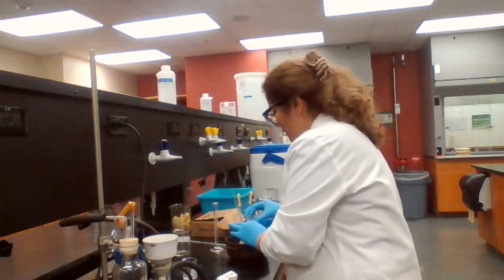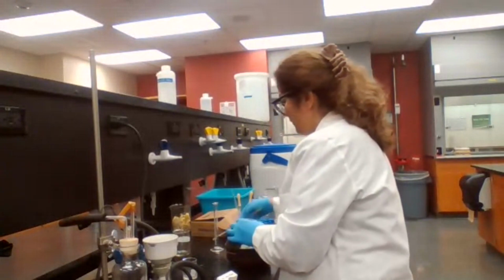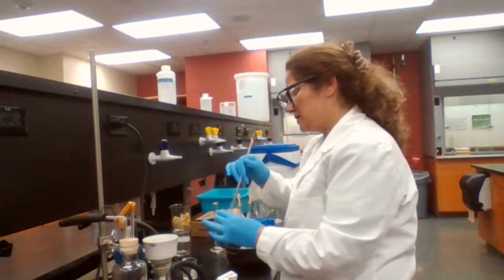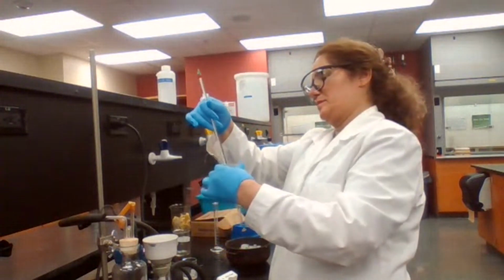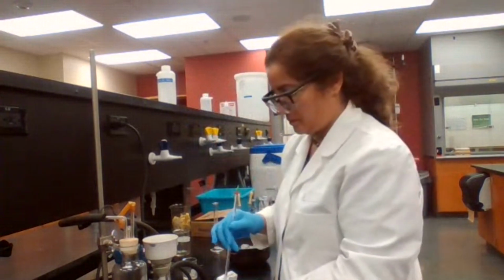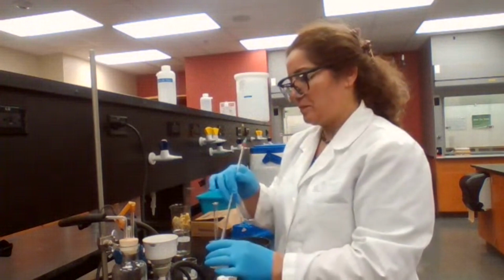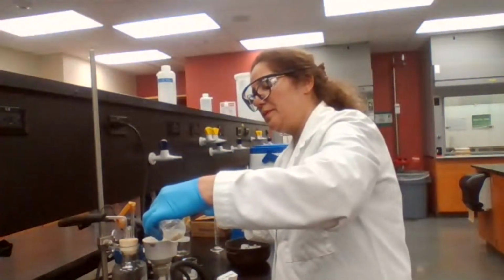And pour the mixture carefully over the, maybe I should wait until this... over the filter paper.